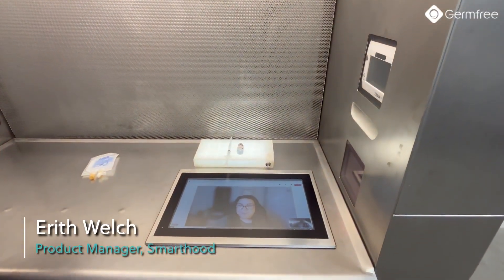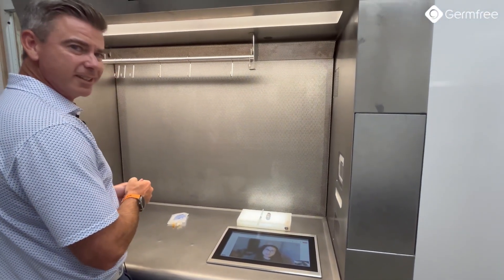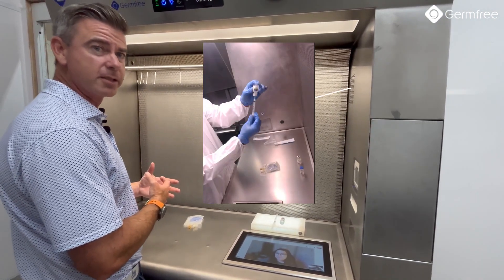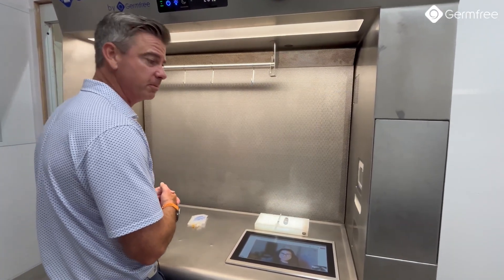Aerith, how are you? Can you see everything that we're doing? I can see everything that you're doing. This has been really helpful for in-process checks, for audit, or for training — to be able to see exactly what they're doing. She can see everything that I'm doing here within the SmartHood.